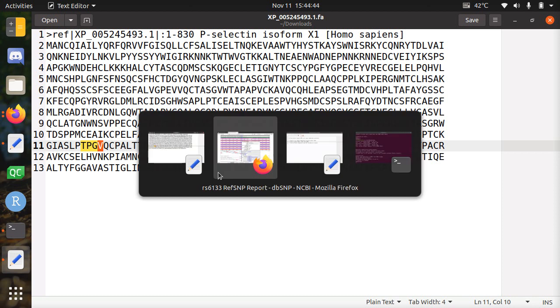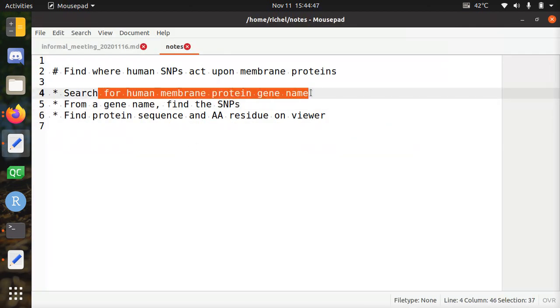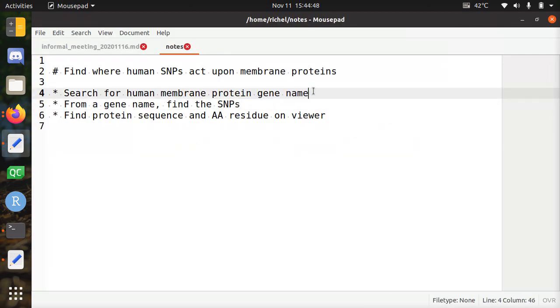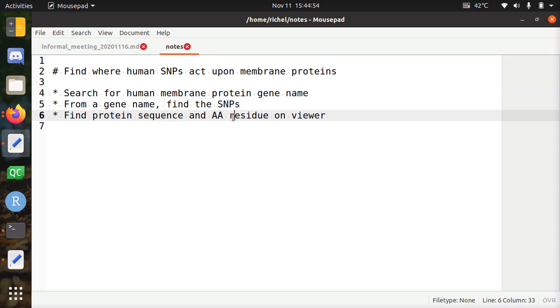So in this video I've showed you how to search first for a human genome, for a human membrane protein, find a SNP, and find a protein sequence, and which amino acid the SNP worked on. That was the video. I wish you a very good day. Bye.